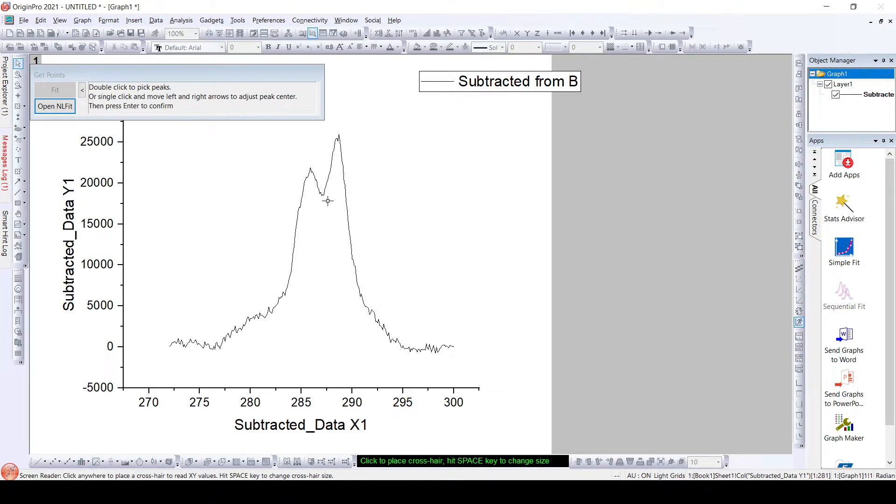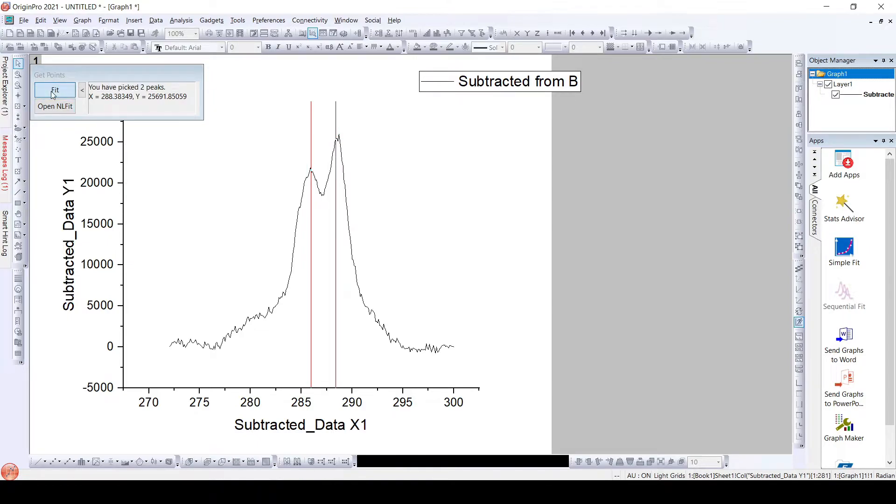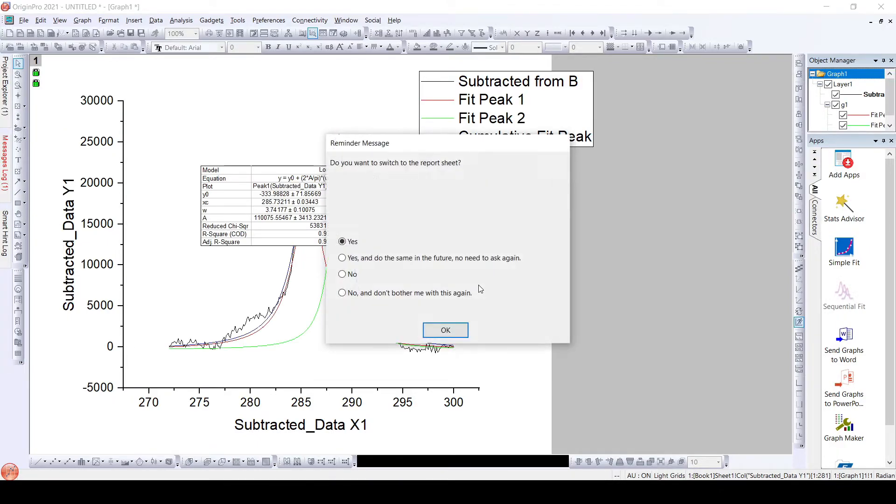As we have two peaks, we will click on each peak to select them, and now we will fit this. Click OK.